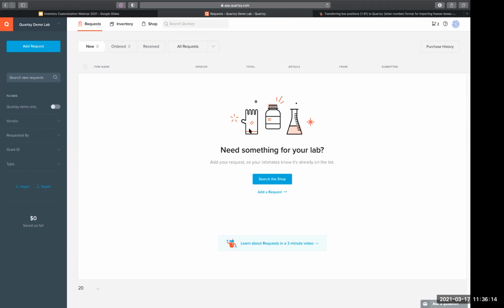What I think is that in the meanwhile, while you're trying to figure out how you can do the barcode scanning and everything, there might be an interim solution for those items that I just mentioned that have a very high consumption rate, meaning that their inventory goes down quickly, and there is need for reordering very fast or very regularly, which is something that I'm pretty sure everyone in this room has the need for. So I think in those cases, at least there should be this option of automatic decrease in the quantity.